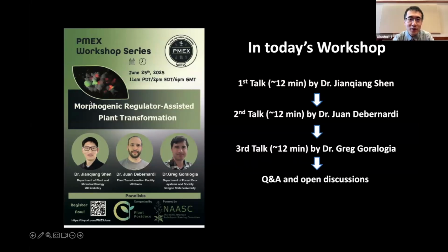Okay. The next question is also about chimeric transformants. Does keeping the callus on selection media for a long time, like 2 to 3 months with subculture every 4 weeks, reduce the number of chimeric transformants?